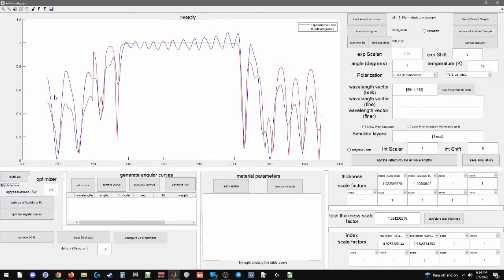What that will do is, every time it settles down and concludes that it's at a local minimum, it'll randomly change all the tuning variables by plus or minus a small range, in this case 0.02%, or sorry, 1.0002. And then it'll re-optimize them. So it's sort of like a pseudo-randomized function optimizer.